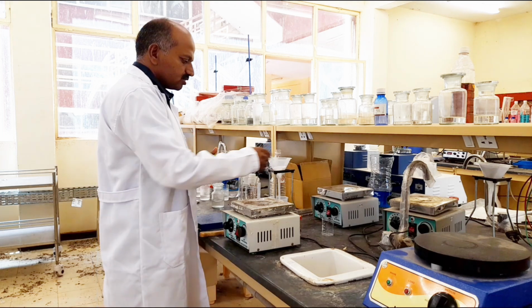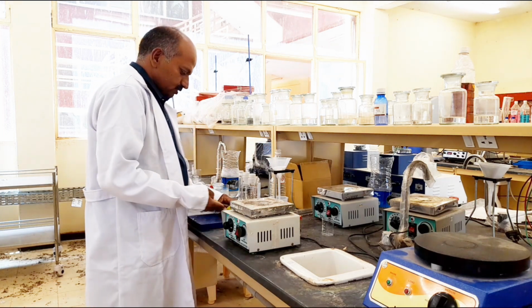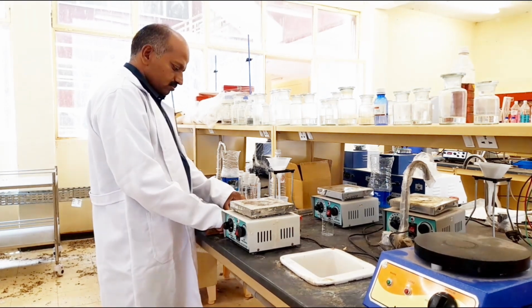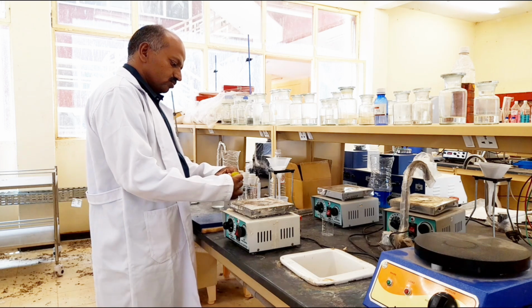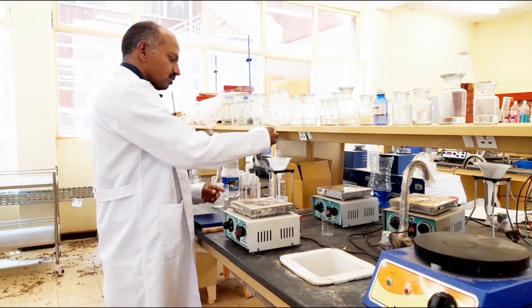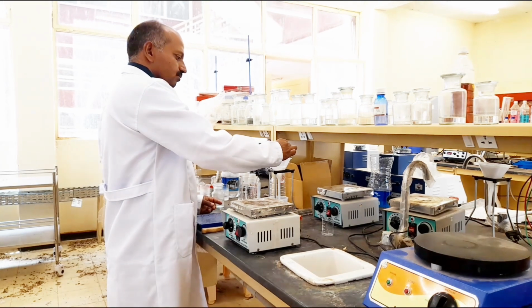This is the filtration process. We have to remove the solid particles present in this juice. So let us make the juice. Now I lay it in 2 halves, and now I am squeezing the juice into the funnel containing the filter paper.